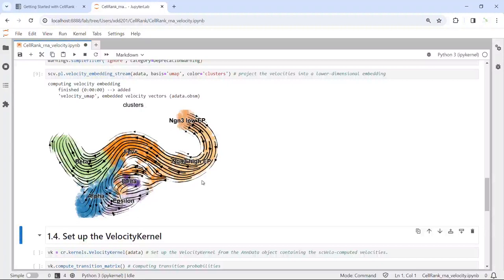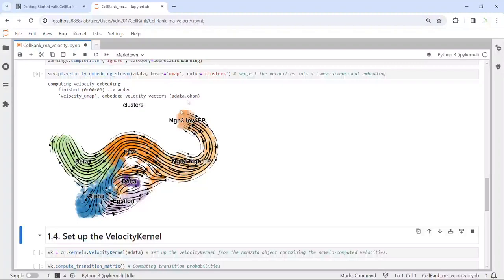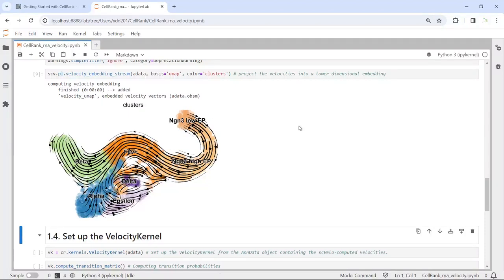Let's see the trajectories. We generated the RNA velocity trajectories. Because the scVelo package also uses this dataset for demonstration, we generated the same trajectory map. Note that the scVelo tutorial also contains a ductal cell cluster in the pancreas, but in this dataset it has been removed. So we have completed the scVelo analysis.